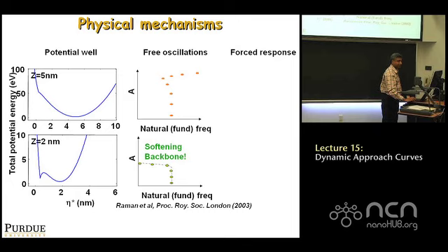And you have this interesting behavior. Okay? So very simple thing. You just got a cantilever separated from a surface. And if you just release this, ping it, and just study how the amplitude is connected to the frequency, this is what's going to happen. Hopefully the potential energy landscape gives you a physical intuition why it would happen, because it's easier to sort of visualize balls rolling on a landscape, right?